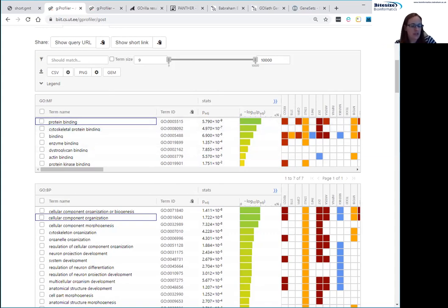So the sets of genes that we were generally putting through these functional enrichment analyses were from sequencing experiments, often RNA-seq or ChIP-seq or similar. And we know that throughout all steps of library preparation and the analysis of sequencing data, quality control is really important, and that biases and artifacts can be introduced into the data at various points throughout the process.